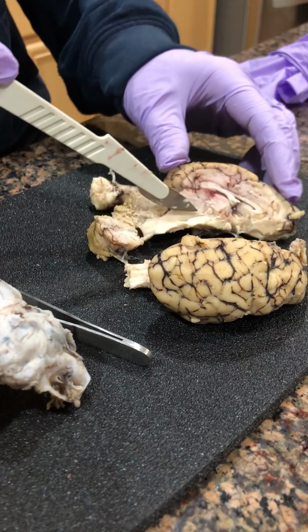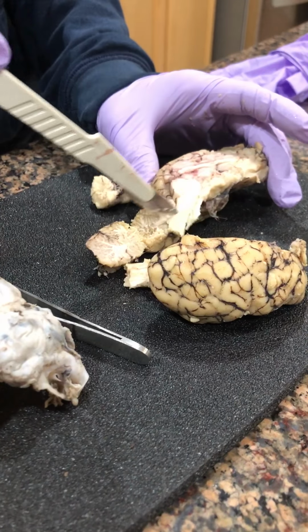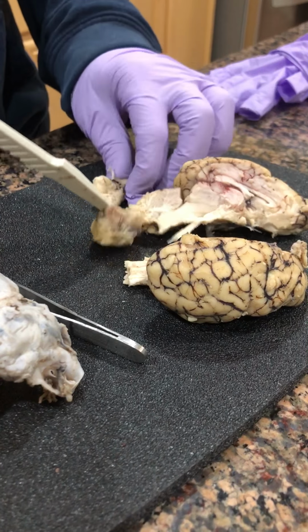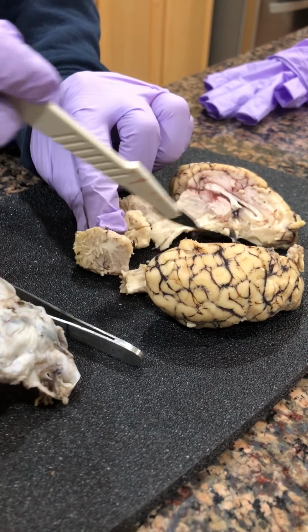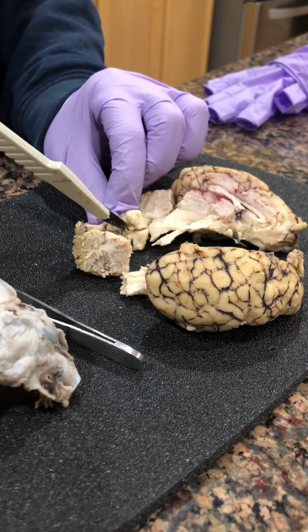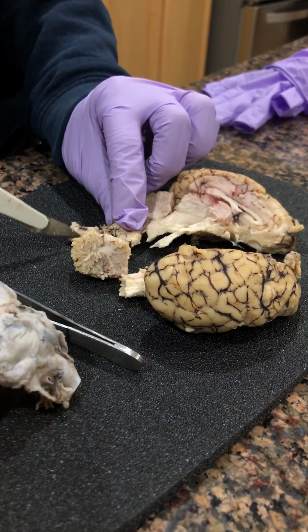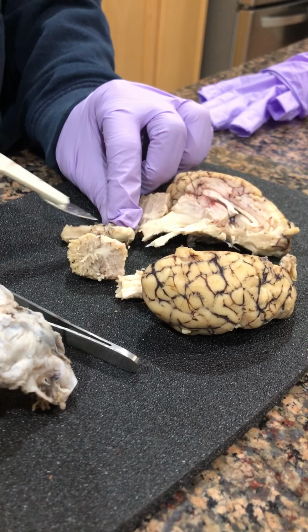And this piece right here, right under here, this is the pons. It kind of hangs down by itself, but that's the pons. Your medulla oblongata, which this piece did come apart, but it would have been this whole long piece here that came down. The spinal cord will be at the very end of it, down here, along with the central canal, which is the circle area.